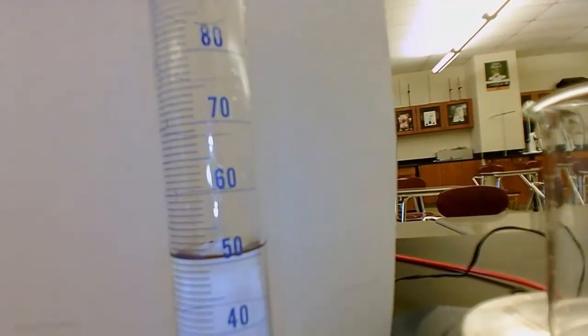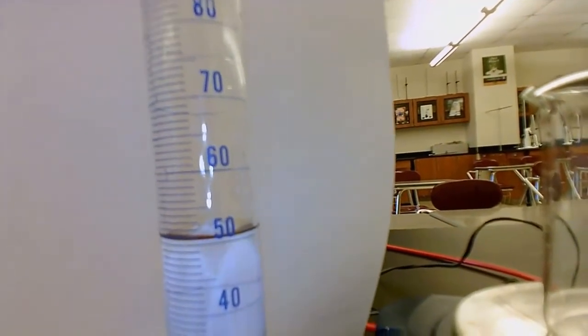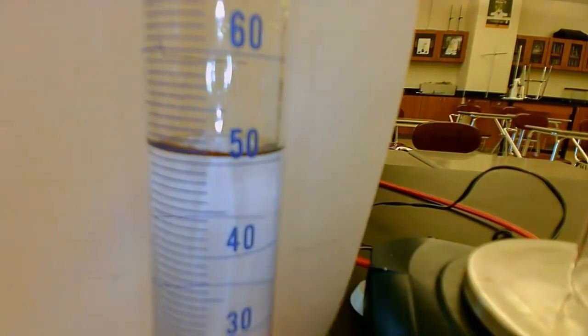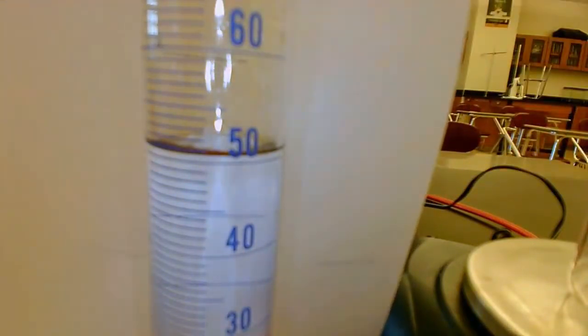So mass should be in 2 decimal places with the unit gram after it. Volume should be with 1 decimal place with milliliters after it. If you're having trouble with this one, we know exactly that we have like 51, 52, 53, 54, 55 milliliters.